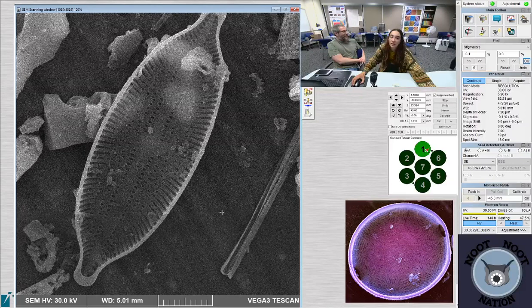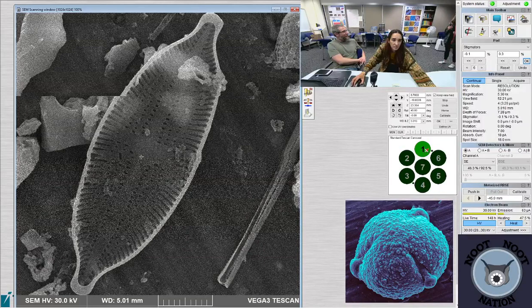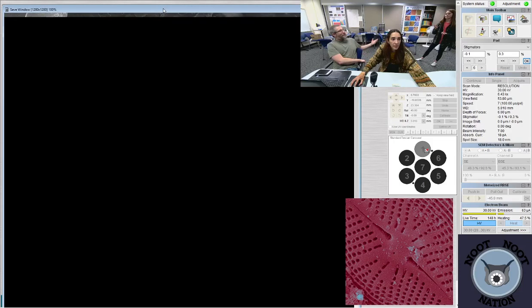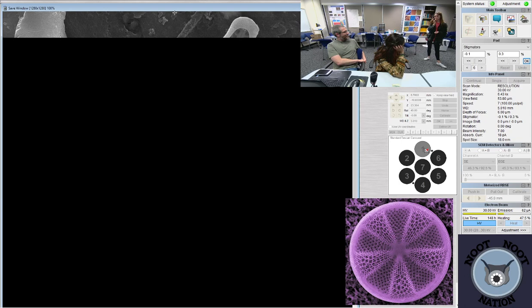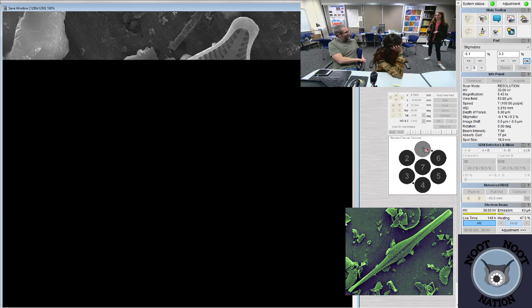Did you make any slides? Or make stubs, like you asked for. What about the slides that were on the slide warmer? The cover slips that were on the slide warmer? Did you make those? Yes. Okay. They're not all done. Those are portions of two different ones. Okay. I was just curious what you were doing. I'm not demanding you stick around and do them. I'm just asking what you're doing. I thought I finished a whole set. I've got horrible news. There's like 400. I mean, you could do 400 in a day. I did 400 a day every time. You could probably fit 200 onto the slide warmer and do them in the morning and then 200 on the slide warmer? Easily. I'd say 100. I can do 100. 200, you're pushing it. Like, 40 takes up half. Unless you put them so close.